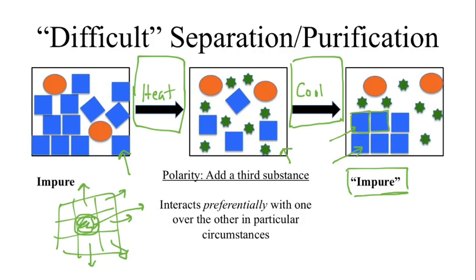Okay, so our hope is that as we cool, we can selectively and slowly cause our product to crystallize out of solution. Okay, if we do it too quickly, then those crystals all jump to each other or grab a hold of each other, and they trap impurities in between. Okay, like the solvent molecules.